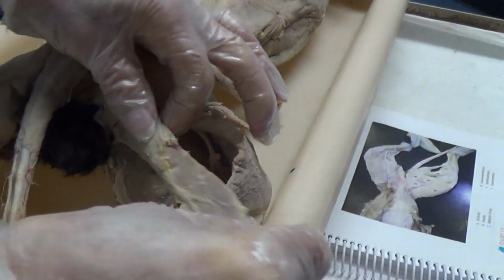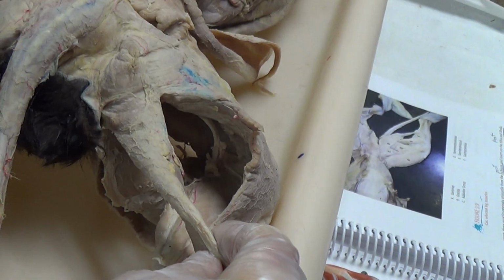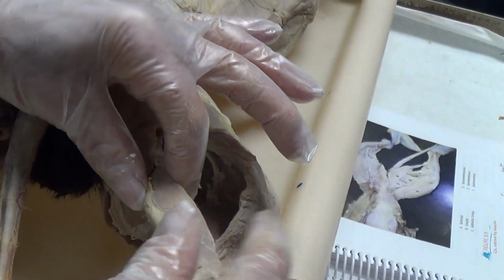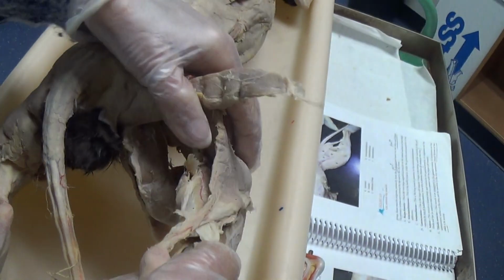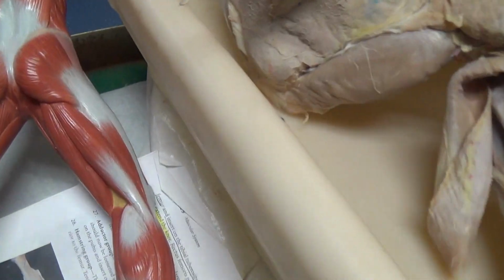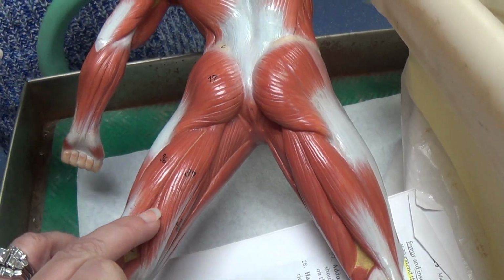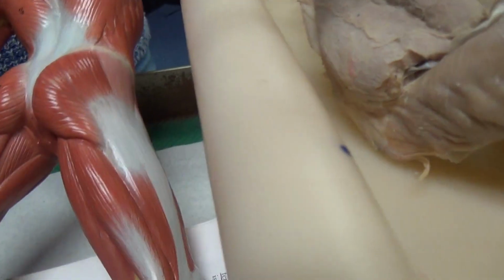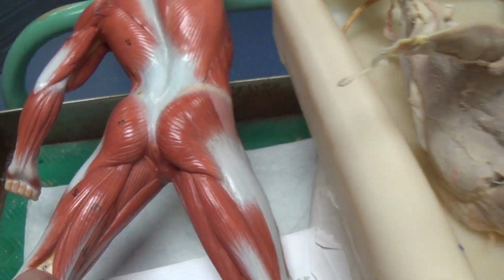Semitendinosus on the kitty is skinny, and it's going down towards the tibia. It usually gets cut, so she's got it in her hand right there, and it usually ends up getting ripped at the tendon, but it's going down towards the tibia. The semimembranosus is more medial and fat. On the human, the semimembranosus is actually kind of tucked, so you can see part of it sticking out from right there, and then part of it sticking out from right there underneath the semitendinosus.